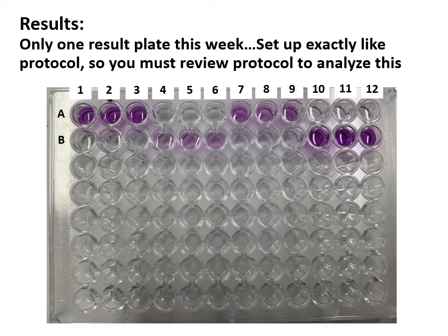And here you have your results. So notice that we only use the top of the wells. In this case, we did not use the full plates. So when you're analyzing, this top area matches the protocol's guidelines for what samples are placed where.